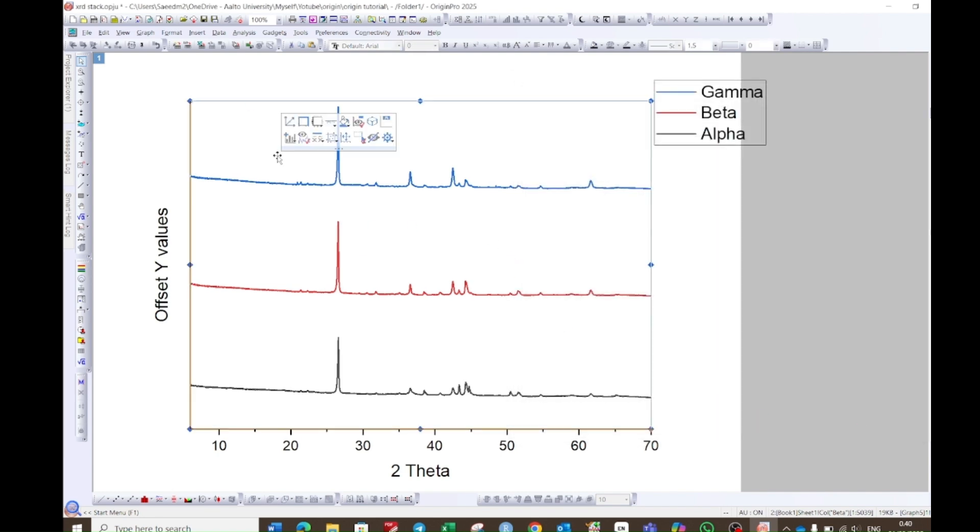Now make a single click on this white area, and then you will see here the options will pop up. Choose this layer frame, and this will make a border for the graph. Double-click on the y-axis. Here make intensity as arbitrary unit.